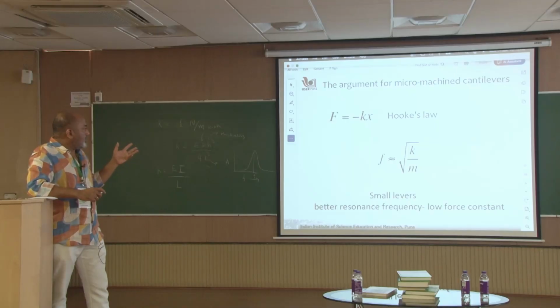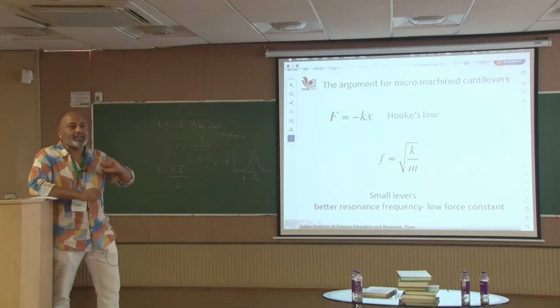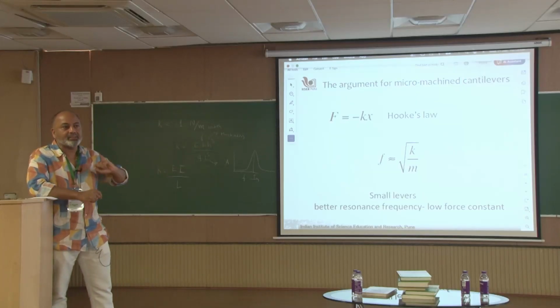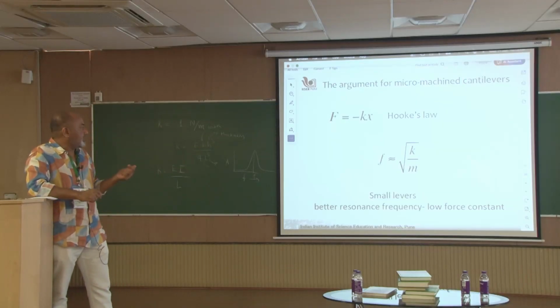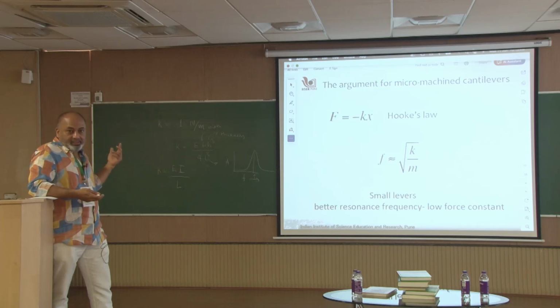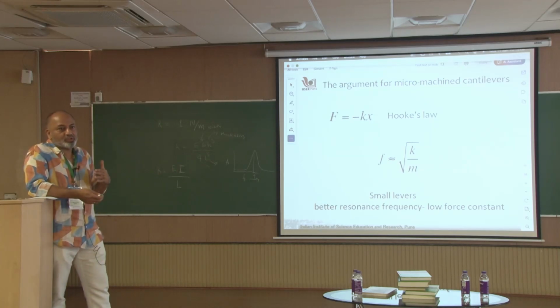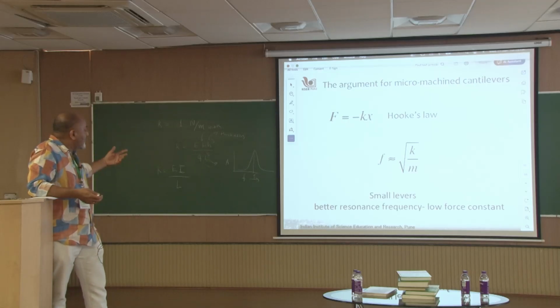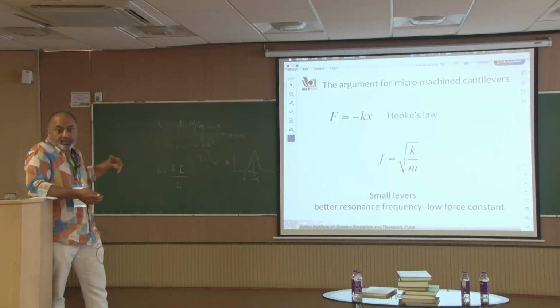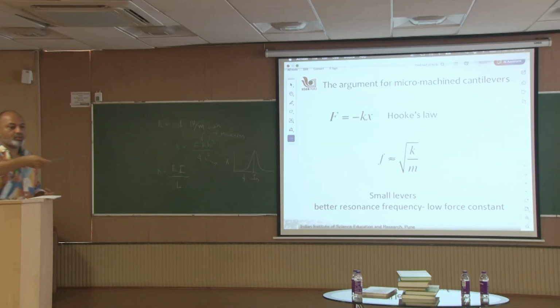Now, see what happens if I have a 1 millimeter long object. If I start increasing the length of the cantilever, the weight increases, the mass increases. Thickness has, of course, no problem. The smaller the thickness, the better in a way, and it reduces the mass, but the length of the cantilever is problematic. You start increasing it, and you see the k changes a lot with L. It's a cubic.